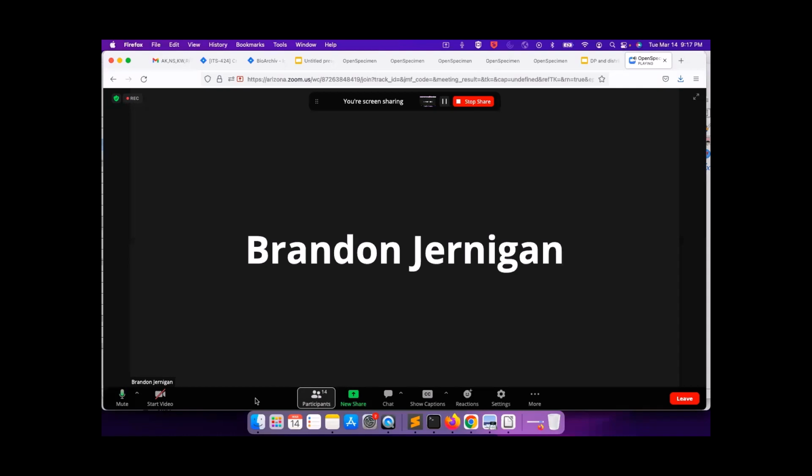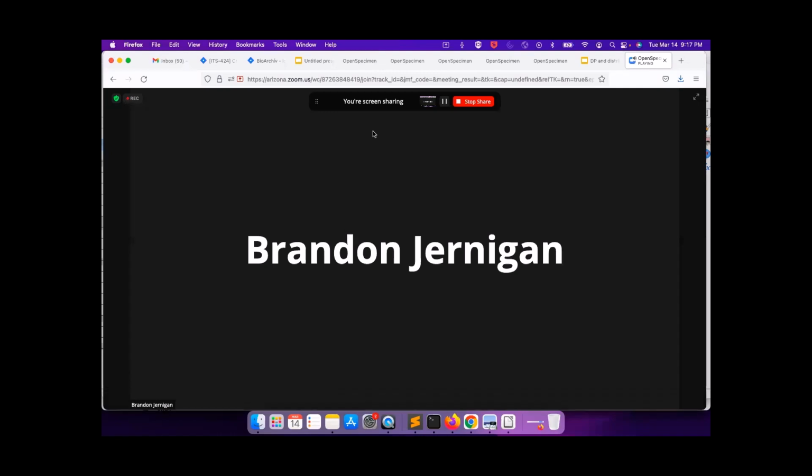So that is one part, and secondly, I think there was one request where the cart needs to be shared between the institutes. I don't remember whose request that was. Yeah, so the one I was thinking of is if we have another investigator, it kind of goes into the catalog thing you said, but there might be an investigator that has access to OpenSpecimen, in which case they could pick their own specific specimens that they want to pull and then send it to us, and then we could just pull those and ship it based on that request.